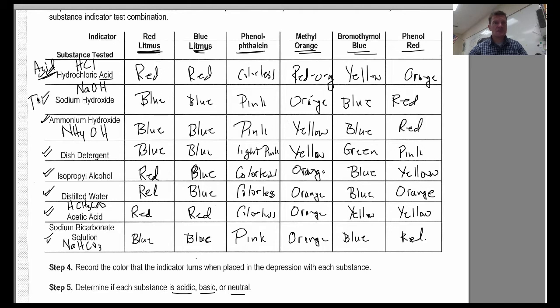So this is basic. This is basic. This is basic. It's turning red, blue, and then this is basic. I'll just put a B there.